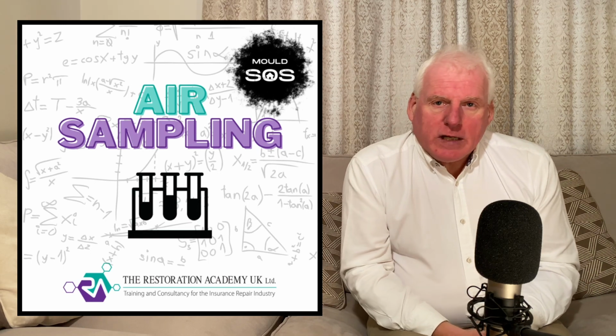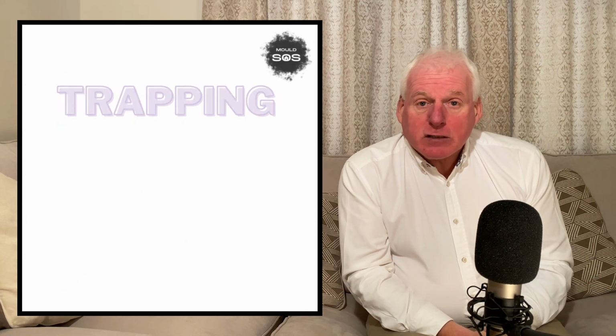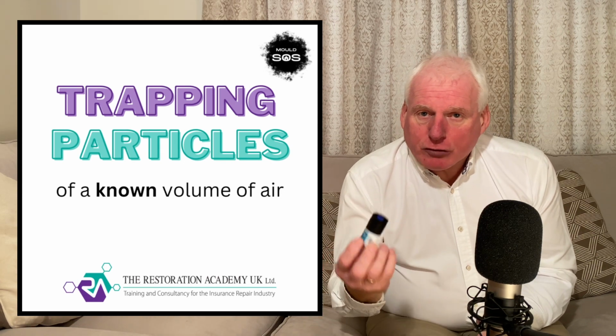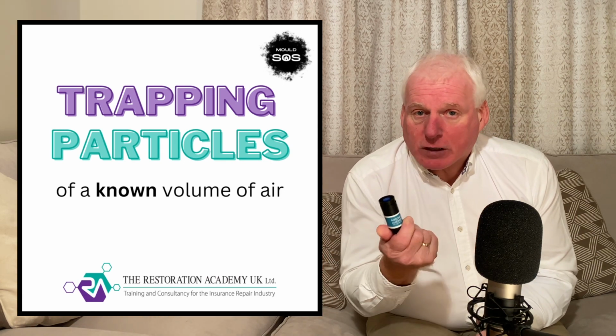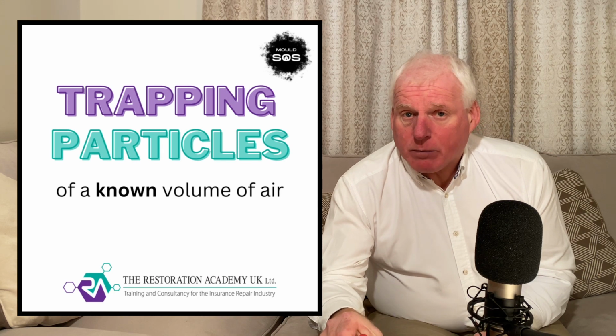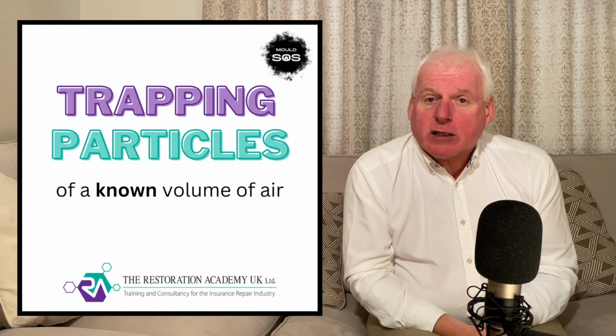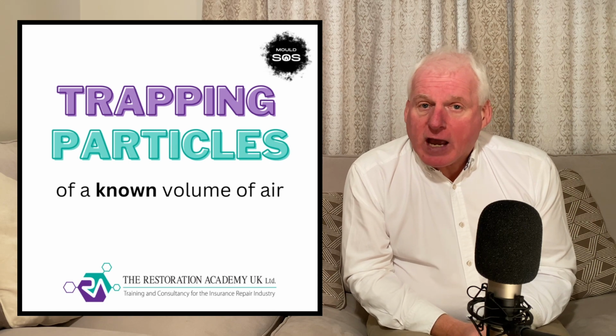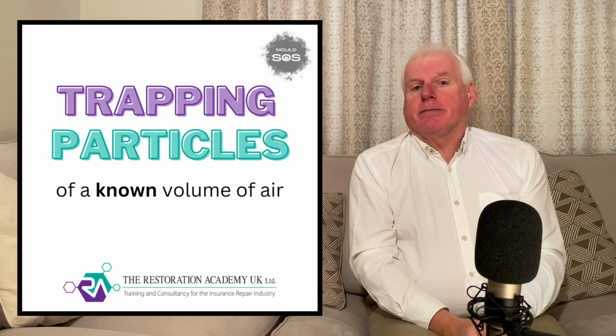So, what is air sampling? Air sampling is a method of capturing particles from the air into a trap of some kind. The trap can be an agar plate or a filter cartridge. The volume of air sampled will be determined by the flow rate set on the pump and how long the pump is allowed to run. Recording the volume of the air is very important when analysing the data.